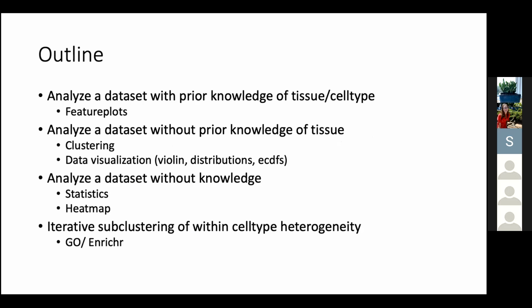This is kind of our outline. It's not very well thought out, but it kind of works. Basically, we're going to go over feature plots. We're going to go over clustering and data visualization. We're going to go over statistics, which is my favorite part. And then we're going to talk about heat maps. And then, if we have time, I'm going to touch on GO and Enrichr and stuff like this.